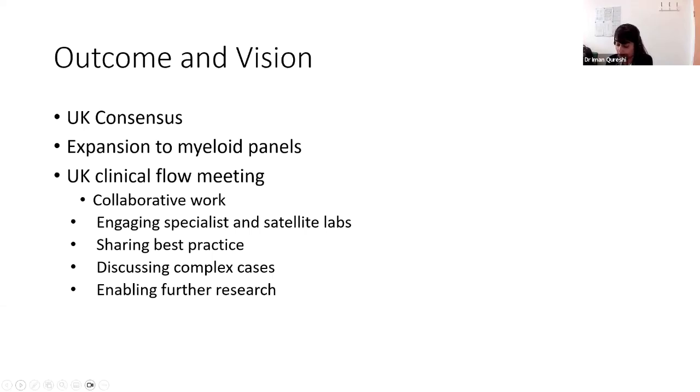So in summary, sorry, that was a bit of a quick tour through the project. But essentially, again, a big thank you to all of those that participated. I think it has provided, hopefully, a valuable insight into real world UK NHS practice, and I don't think there have been many projects like this. It highlighted that there is a lot of commonality between the flow labs, but there are some differences.